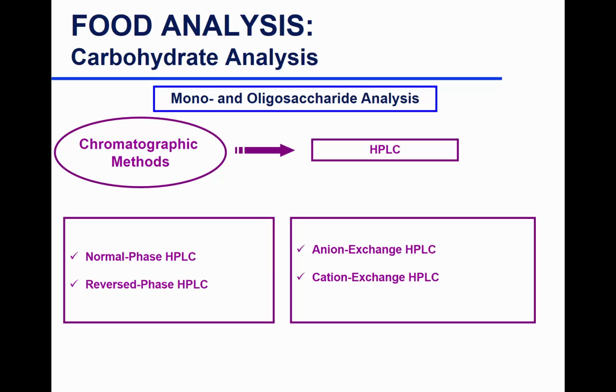So what about anion exchange HPLC? What kind of ions are we separating? Oh, come on. Anion exchange chromatography. What are we separating, Ben? Anions. Thank you. So we are exchanging anions, negatively charged. So the stationary phase is what? The functional groups are positively charged. And the opposite is true for cation exchange chromatography. I won't give up. I'm going to continue asking you.